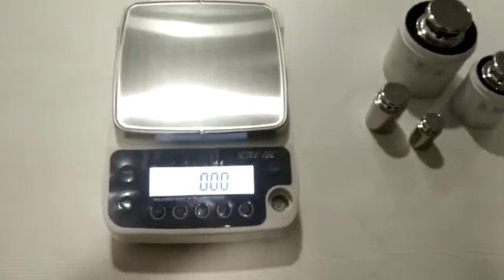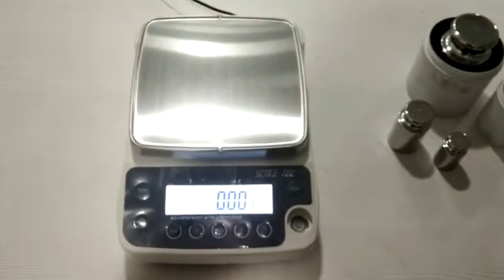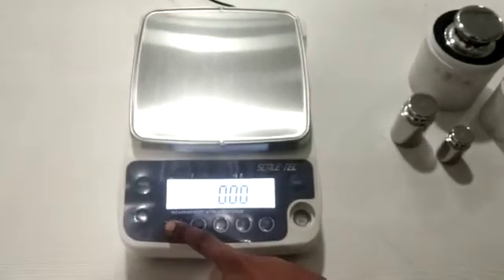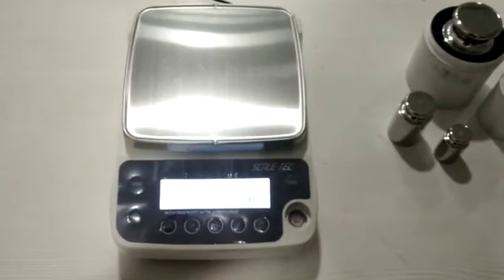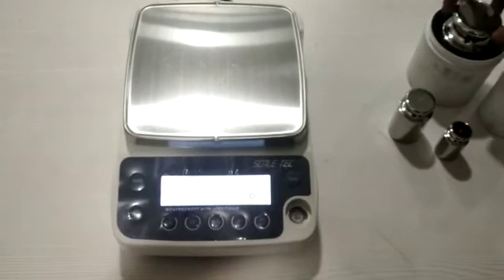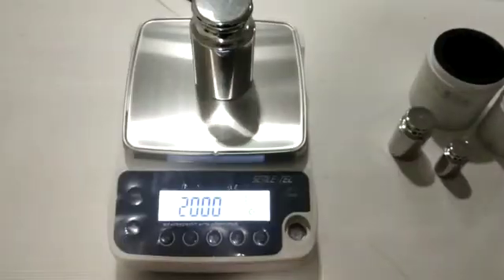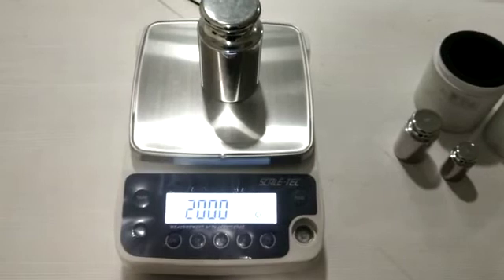Now for doing the calibration, the best part of this machine is that you get calibration with a single press of a key. You just need to press the CAL switch and you will see 'CAL' on your display. The machine will then ask for the weight, so put a 2 kg weight on the balance.